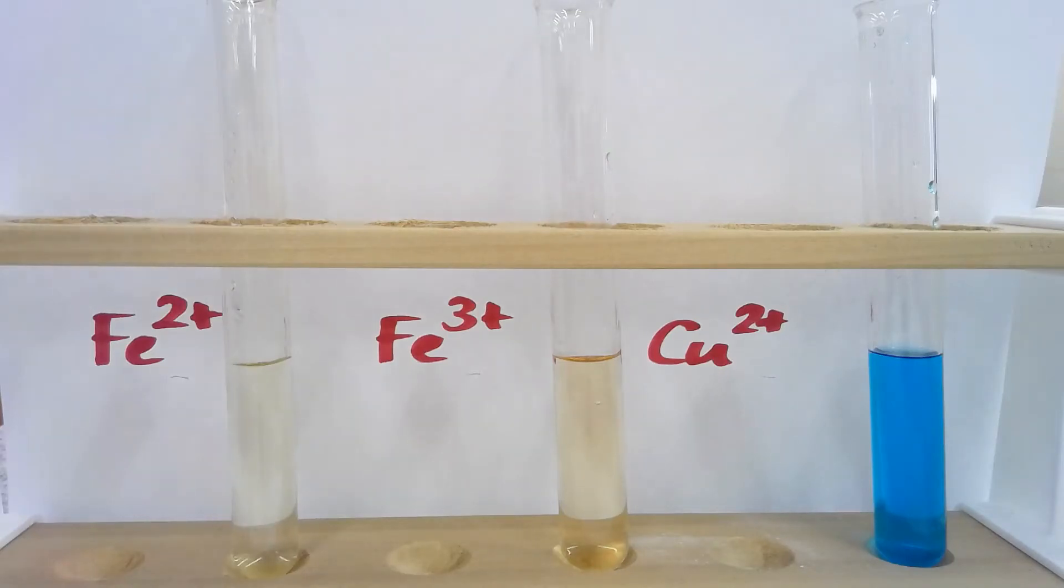This is an experiment that we can use to positively identify some transition metal ions. In the left-hand test tube, we have a solution containing Fe2+ ions. In the middle, our solution contains Fe3+ ions, and on the right-hand side, our solution contains copper 2+ ions.